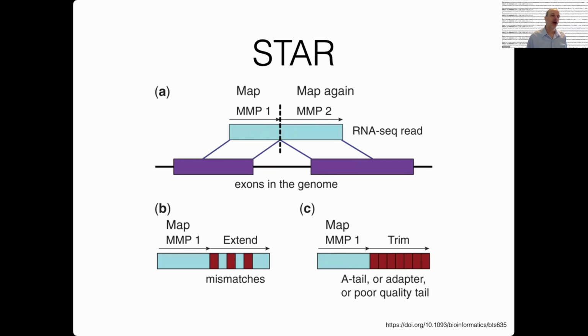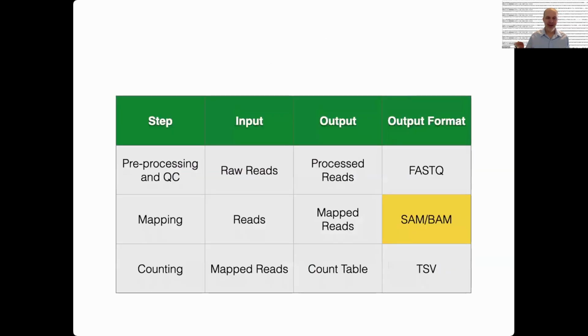And again, the algorithm that's used, I'm not going to go into the details. It's somewhat more sophisticated than that simplistic searching that I mentioned. We're not going into the algorithmic details just because there's not time. But I think it's reasonable to just think of it as doing a simple search, how you would do it by hand.